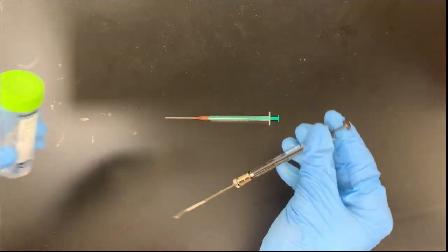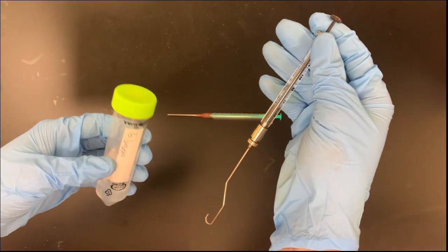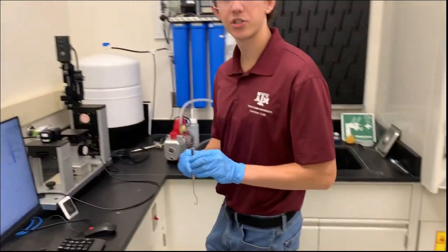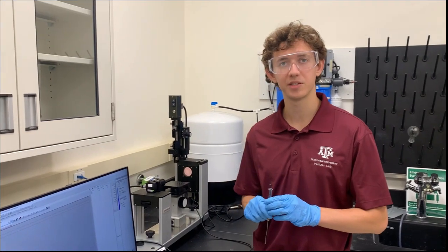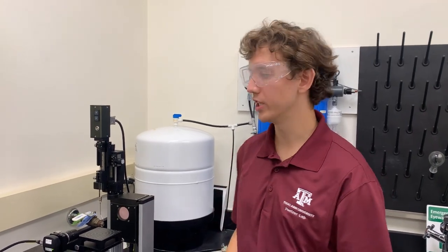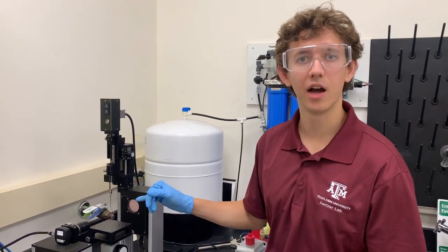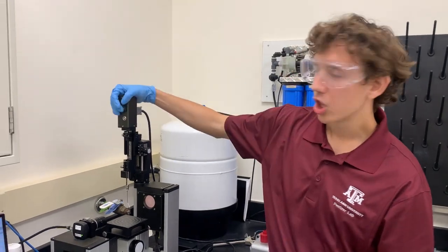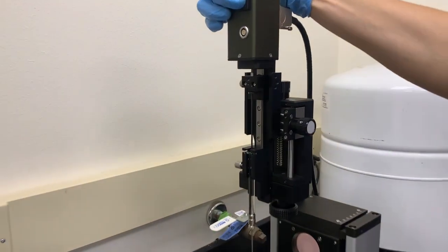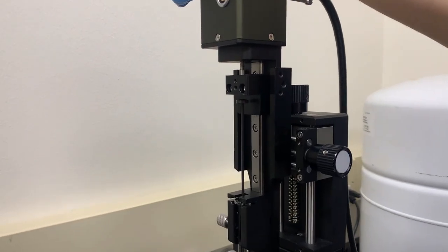Next, you will fill your syringe and needle with your droplet phase. Afterwards, we'll head over to the goniometer and attach the filled syringe to the dispensing system. After loading your filled syringe into the dispensing unit of the goniometer, lower the electronic plunger until it just barely touches the top of the syringe plunger.